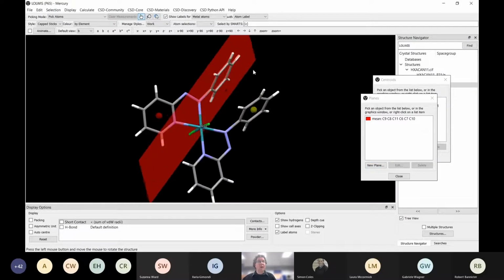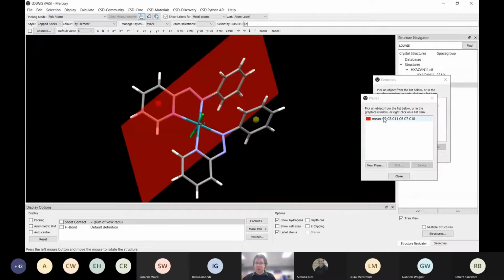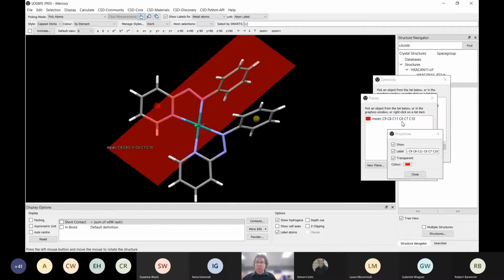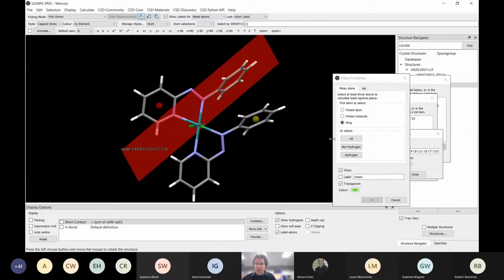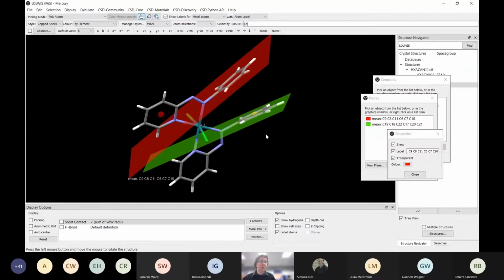And now you have a plane, and it is defined. If I actually click on it and have the label, you can see it's actually mentioned where it is. Okay, I'm just going to do one more plane. Again, I hope people aren't colorblind. We can do green. So we're going to have a ring. So you can have overlap of planes and centroids and things that can overlap.